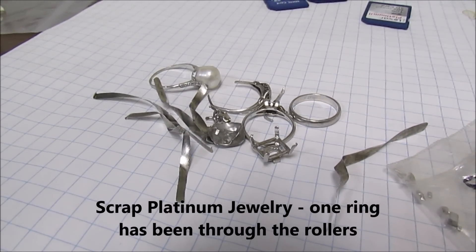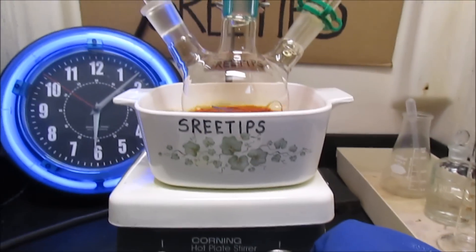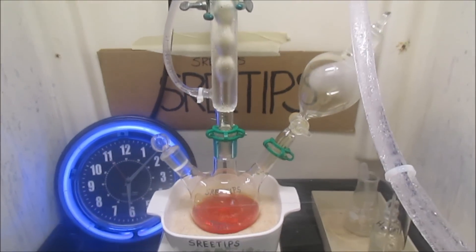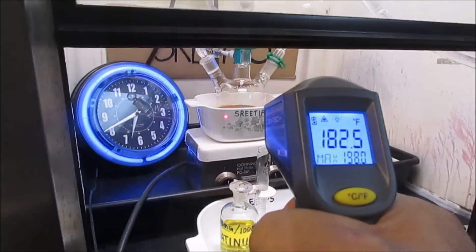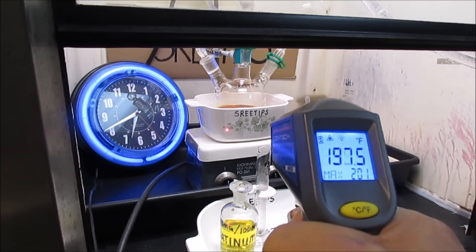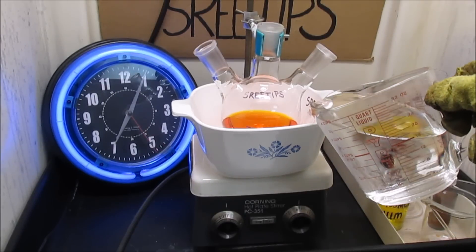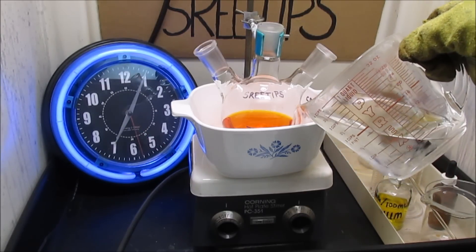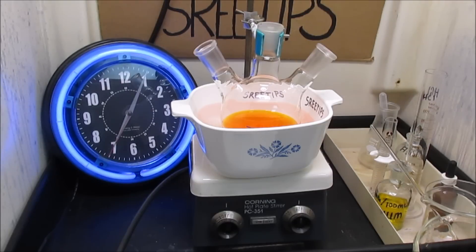I checked the reaction vessel and can't see any more pieces of metal, so I'm going to go ahead and turn the heat off and let it cool down to room temperature. I've got a handheld digital thermometer here — the solution is still up around 195 degrees. I've removed the sand and I'm going to use a hot water bath to evaporate the solution down to a syrup so I can do a classic denoxing with hydrochloric acid.